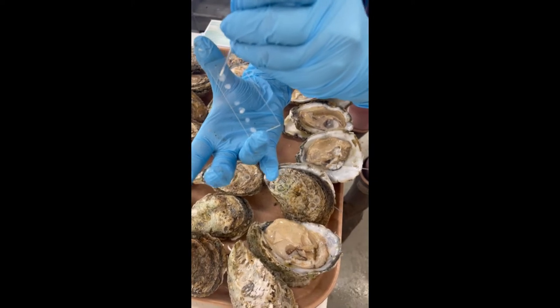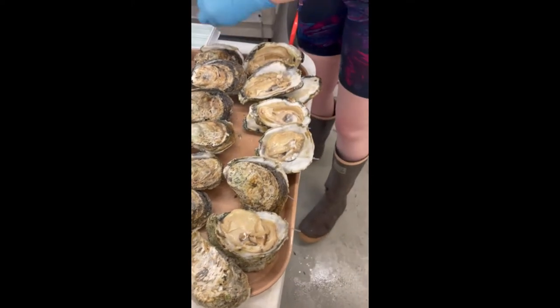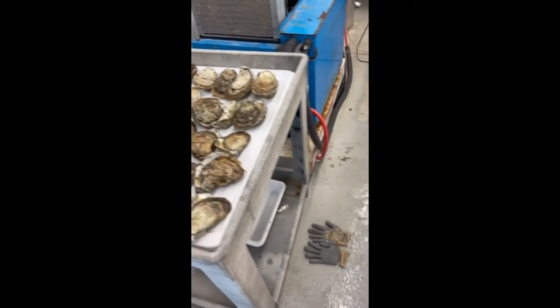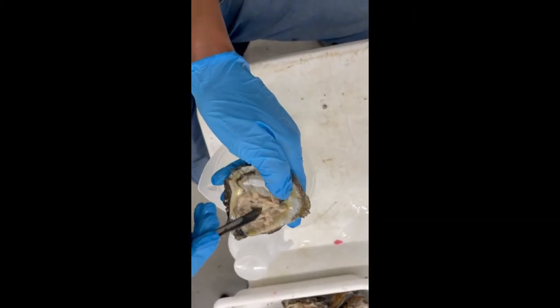Looking at the slide under the microscope helps us determine the gender of the oysters as well as the quality of the reproductive cells — do the females have a low egg count or a dense amount of eggs, and do the males have actively swimming sperm or non-actively swimming sperm? This data is important for determining which oysters we'll be using for the spawning process.